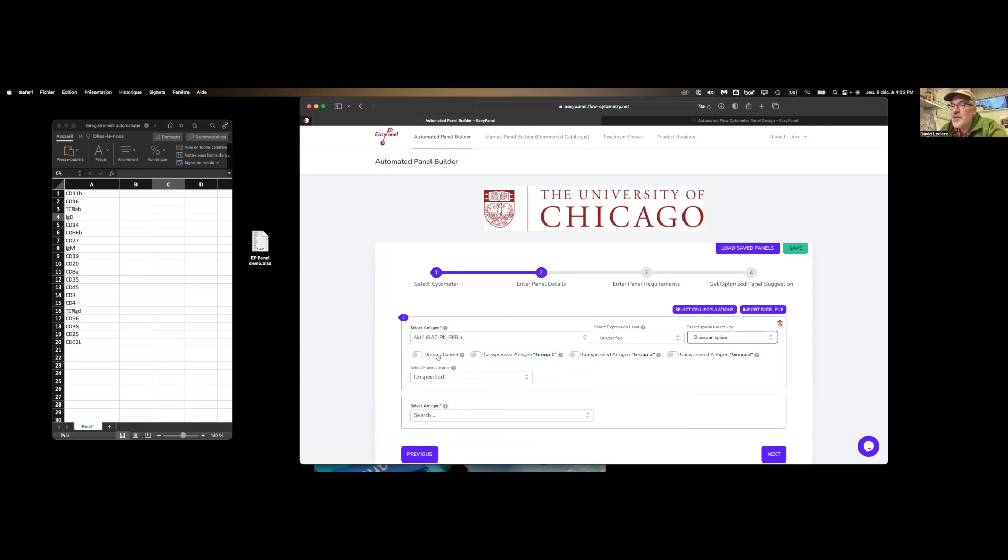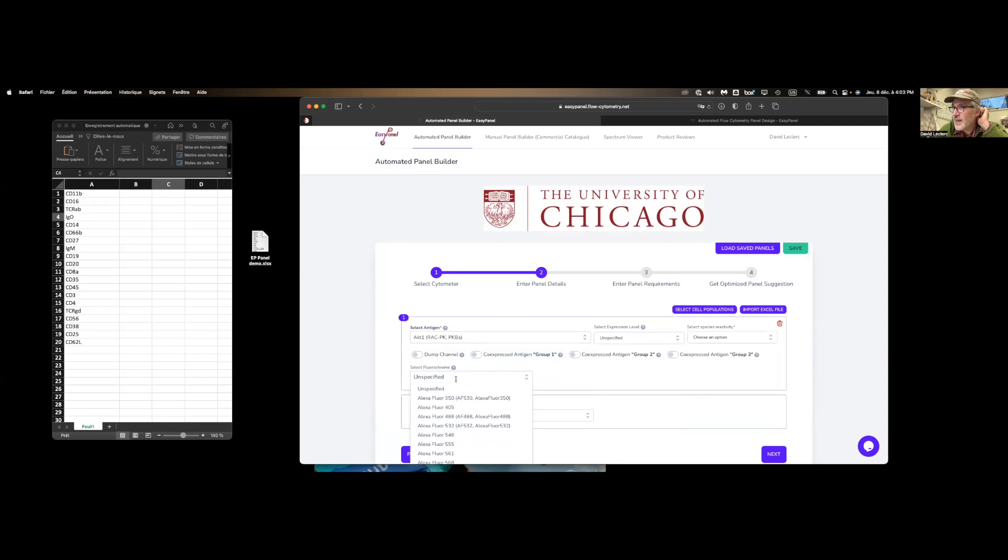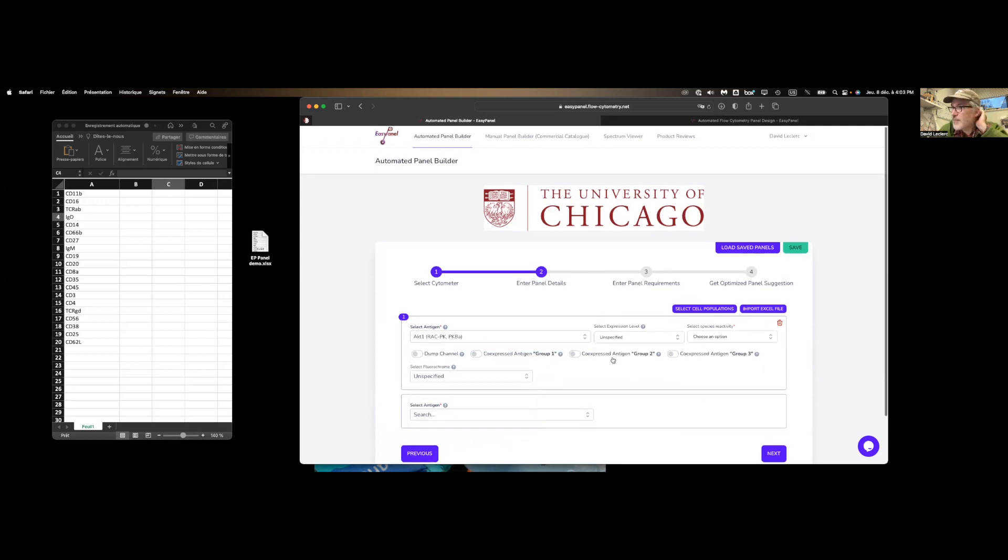If you have a list of antibodies already in your fridge and those are the ones you want to use, you can specify a fluorophore at this point. It gets tedious to do it manually.